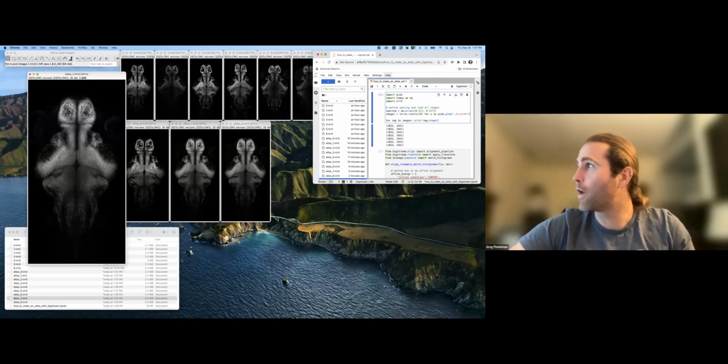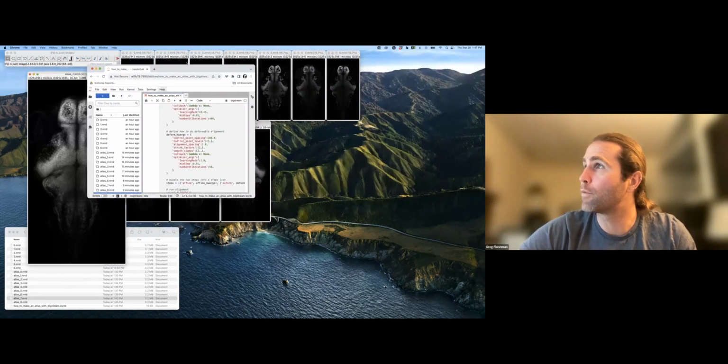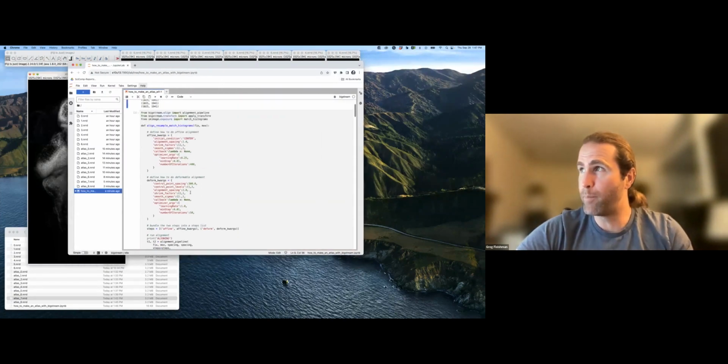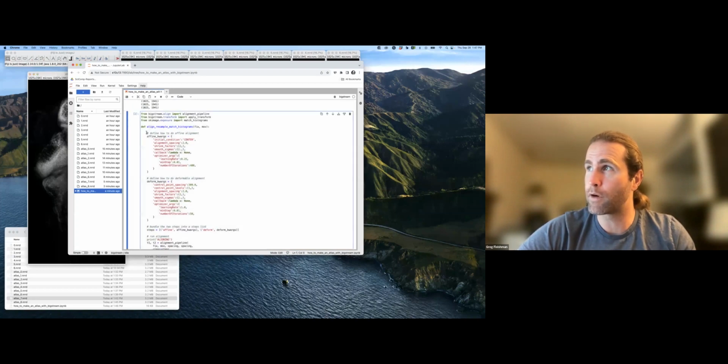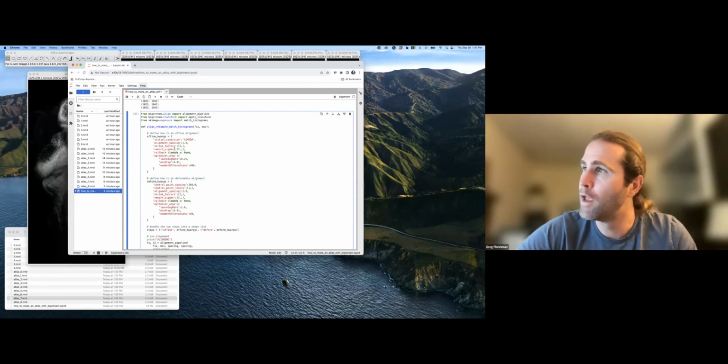Yeah, no, you're absolutely right. I chose parameters for the registration overall here. I didn't go into them in detail because I've talked about using BigStream for image registration in previous how-tos, and I've talked a little bit more about what all these parameters mean in those presentations. But the choices that I made here were all meant to be fast because we're doing multiple rounds of many registrations here, and I wanted it to show up in almost real time. But if I increase the spatial resolution of the deformable alignment and let it run for more iterations, things would probably move a little bit more.